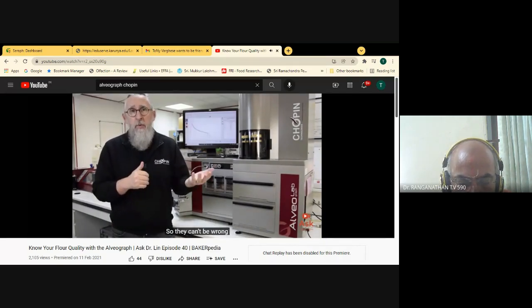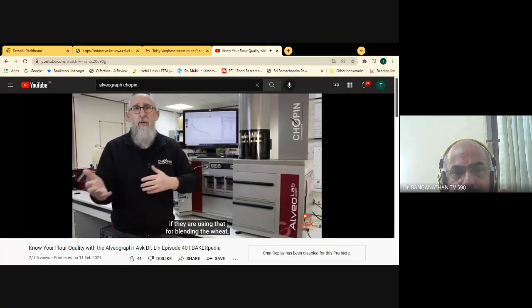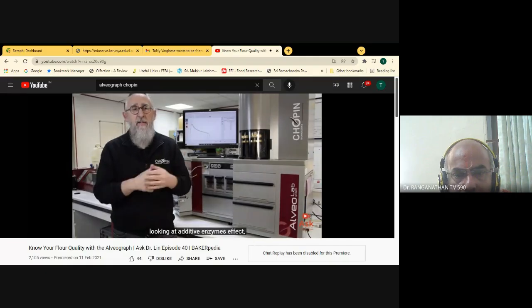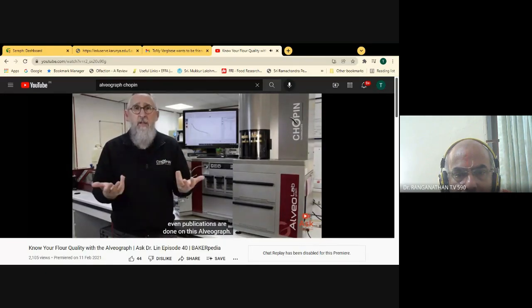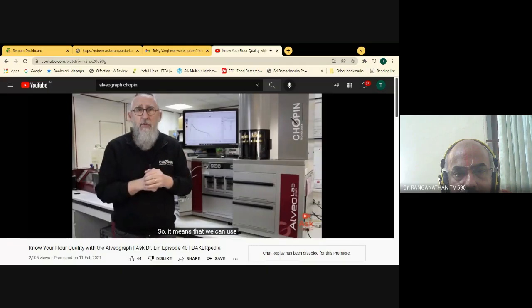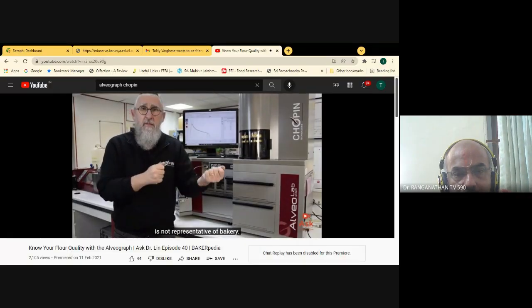So they can't be wrong if they are using it in their routine, for blending the flours, looking at additive and enzyme effects, even in publications on this. So it means that we can use this constant hydration anywhere. Then the second thing is that people say constant hydration is not representative of the baker.